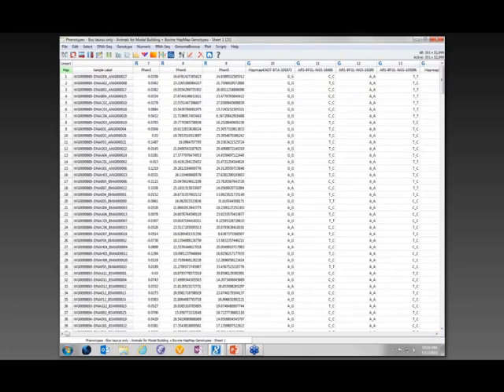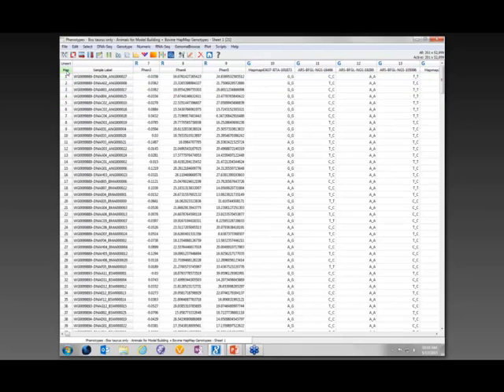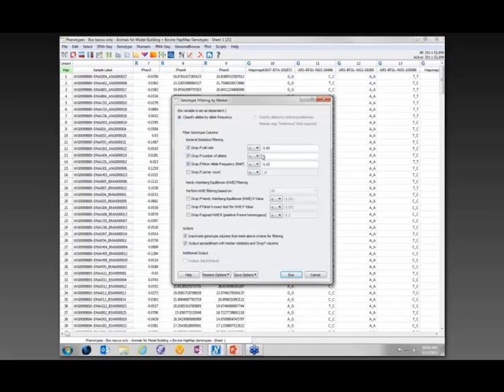If I expand this a little bit more, I can see that I have my marker map with chromosome and position in it, and some Illumina strand information as well. The first thing that I want to do is make sure that I filter the genotypes down to good quality markers. So I will just perform a quick filtering by marker statistics using the defaults for those top three, and we'll run this.